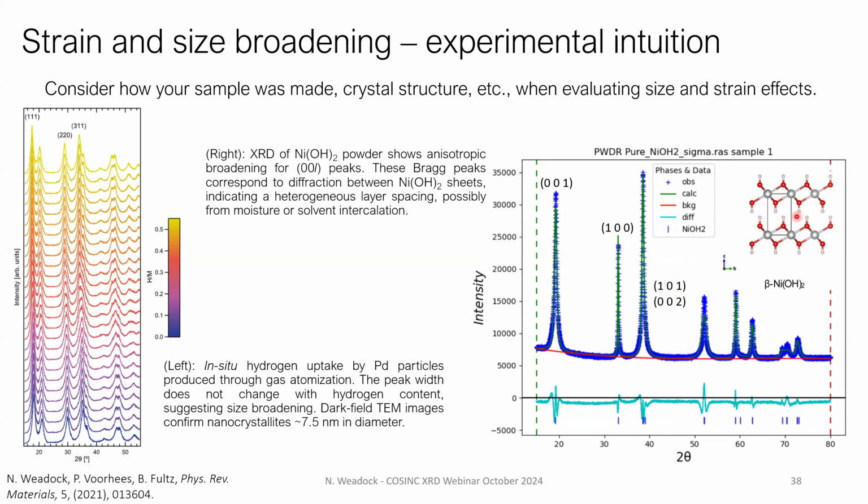This is likely coming from some solvent intercalation or water existing between the planes, giving you that inhomogeneous distribution of lattice parameters. So this would be primarily a strain effect that I'd want to refine for.